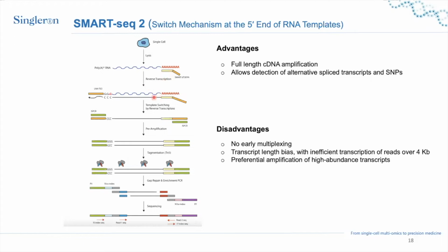And after that, normally for the reverse transcription, they use the MMLV reverse transcriptase, which adds additional bases at the end. These bases serve as a template for the second strand synthesis of the DNA. And this is what they did here. And they amplify this.